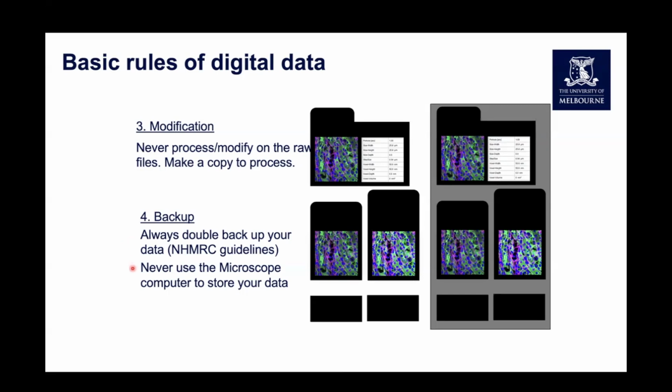The other really key thing that we find in our platform is please do not use the microscope computer to store your data. There are often lots and lots of people who have access to that. We have had instances in the past where people have accidentally deleted people's data, and that data is gone if you haven't already backed that up. So get in the habit of using Data Mover, which is what we use in our platform, to get that data off the computer as quickly as possible. And then we'd ask that you delete that from the system next time that you're on the microscope.